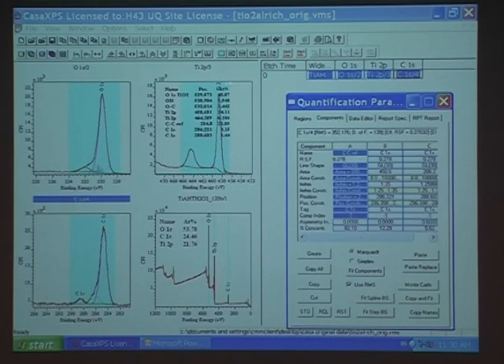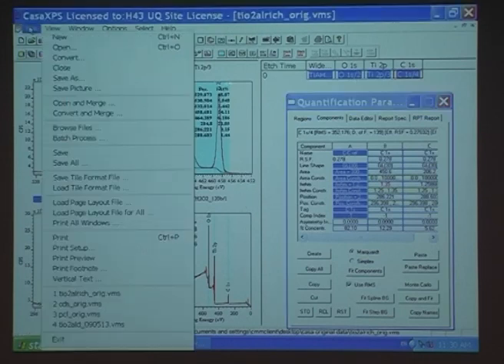Oh, there's some OH there. There's a lot of carbon on here. Just about every titanium dioxide I look at has a lot of carbon. Okay. It's very reactive. And that's a complete summary. I don't see anything else in here. In the next one, we'll see little bits of something else, and I can show you how to add something that's very small that the survey doesn't identify when you go into the library. But that one's finished.